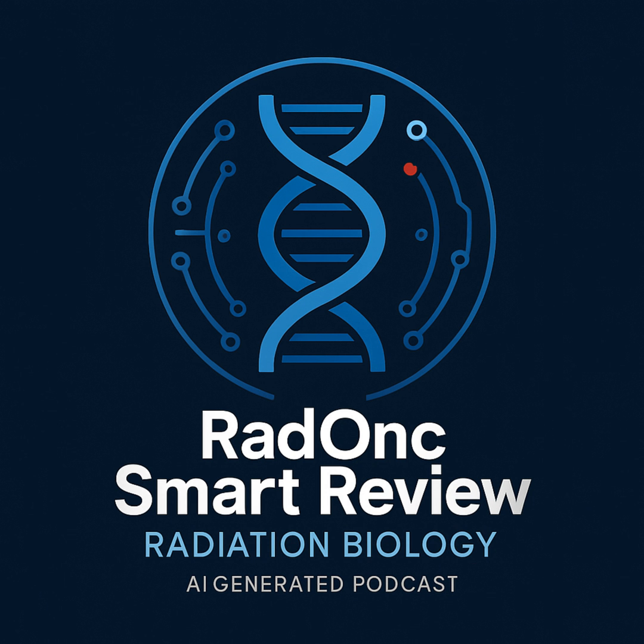And Sanger gives you pretty long, accurate reads, maybe hundreds to 1,000 base pairs. Great for specific things like PCR products or checking mutations. Exactly. It's still the gold standard for accuracy on a smaller scale, but it's lower throughput and more expensive per base compared to next generation sequencing, NGS.